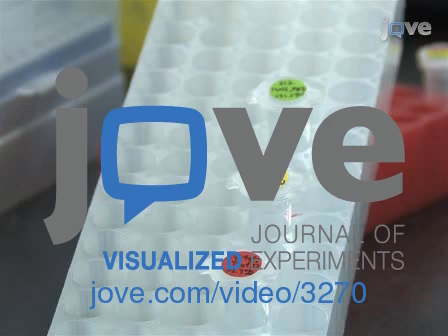Now pour paraffin oil to cover the plate of J4 young adult worms. Pick a single worm and transfer it to an injection pad. Under the scope, position the worm's gonad in the direction of the needle, with the vulva away from the needle. Now lower the needle into position of the microscope view. Bring the top gonad and the needle into the same focal plane.